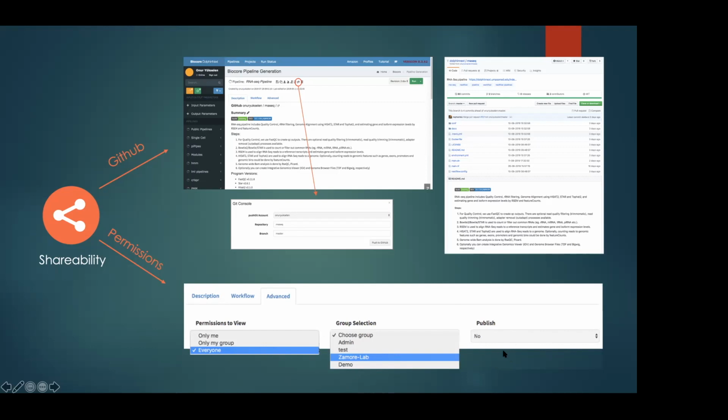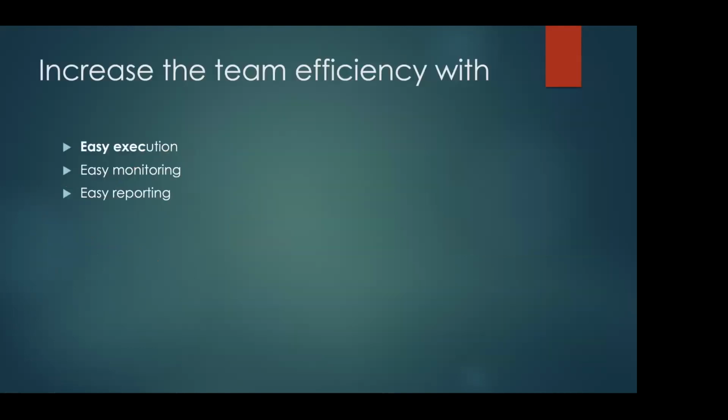So on that date, it's going to be available to everyone. You can share the link of this pipeline in your publication. People can click and see what kind of run you did, with the whole run parameters, what code you ran, and with which versions of the software and everything. You can see the program versions in the pipeline, and people can reproduce your results.